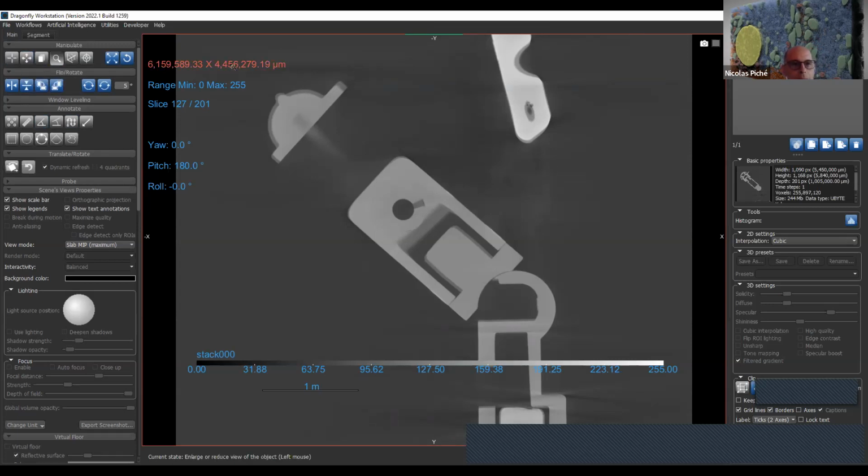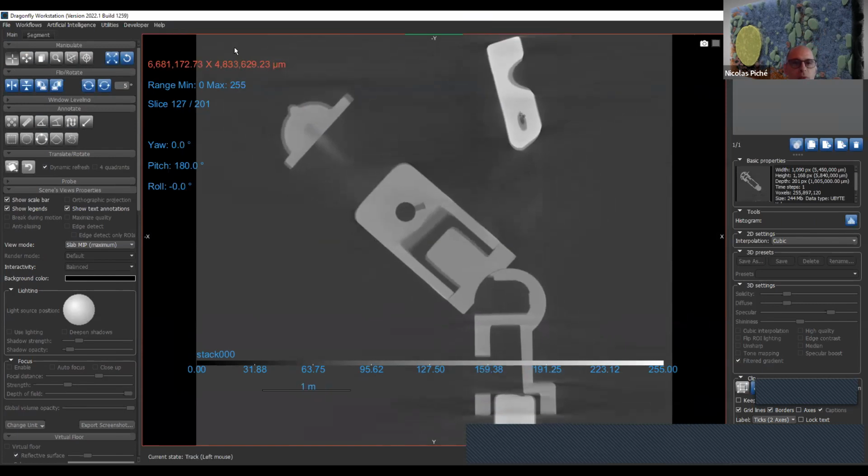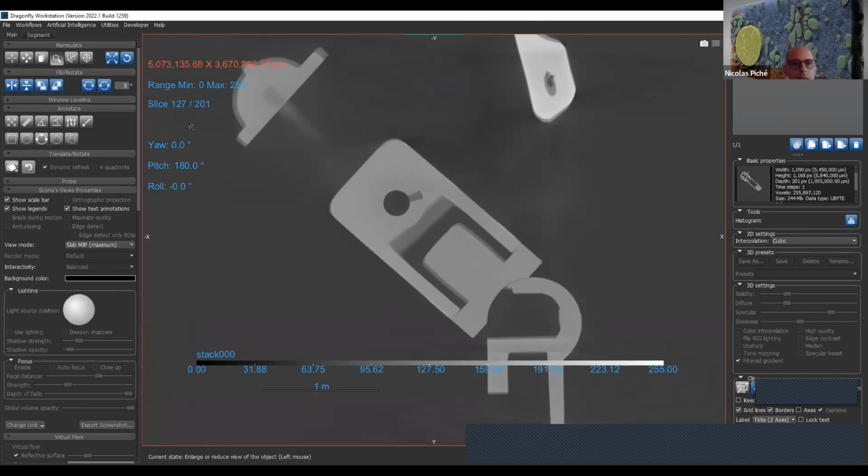When I click on that, I switch to zoom. As you see, the button is automatically clicked. And it's a temporary mode. I go back to the previous mode when I release my left click. If I was in pan, I click on that, I will go back to pan. So there are multiple shortcuts for each of the states. It's easy to get a bit lost, so the trick is to use the buttons at first.